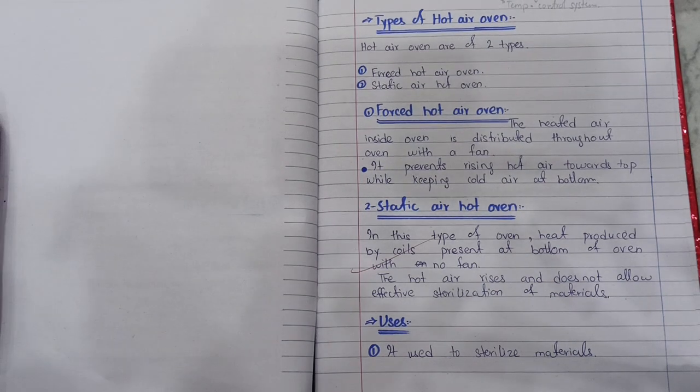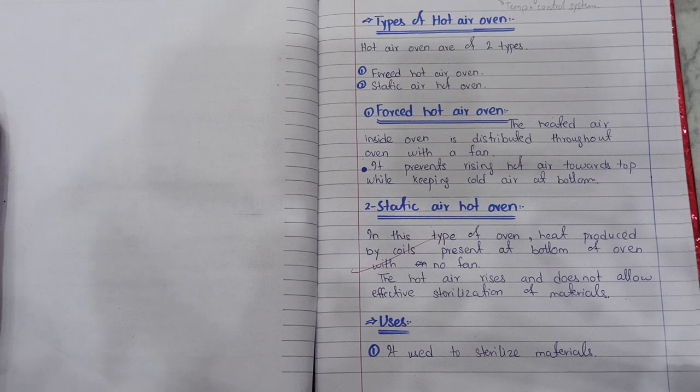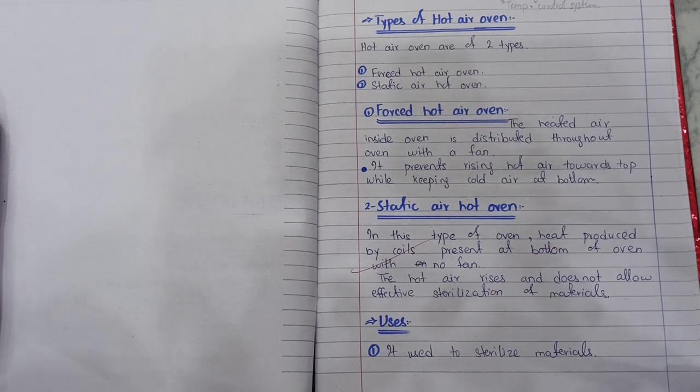So let's discuss the components of hot air oven. So it consists of a timer on it. It consists of a chamber, as you have seen in the diagram. It consists of a heating source and the temperature controlling system.